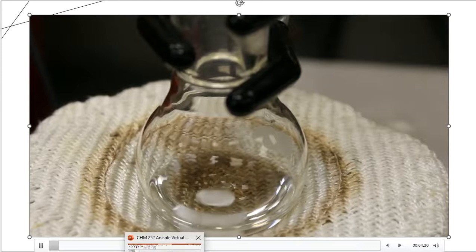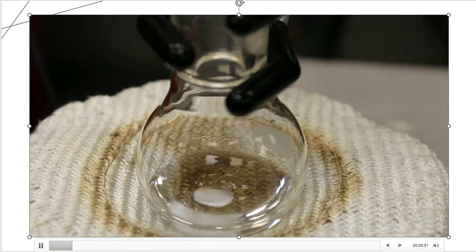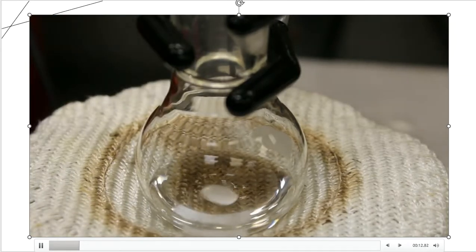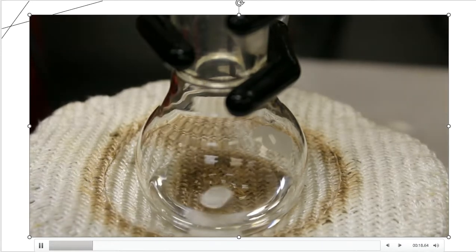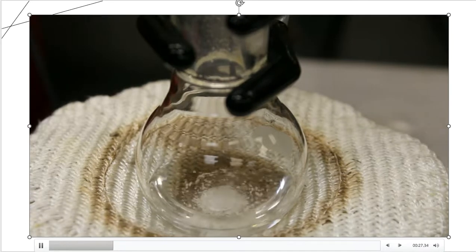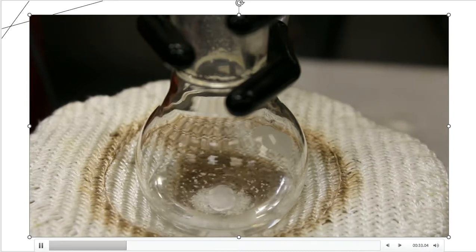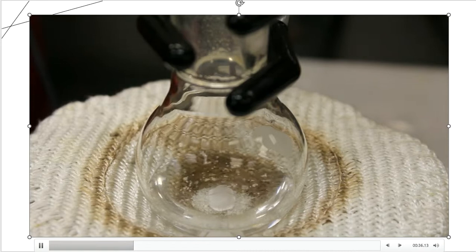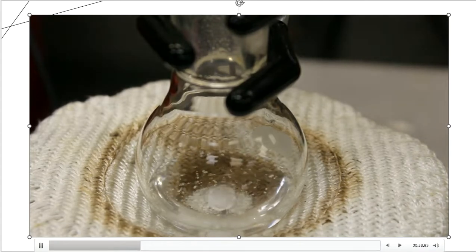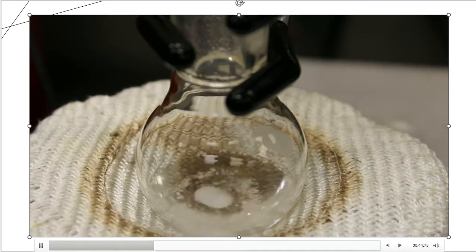All right, so the magnet is stirring in my boiling flask, and now it's time for me to add the aluminum chloride. And it says to add it in very small portions. So I'm just going to come up here to the top, and I'm going to slowly add little bits at a time. Not all at once. I don't want it to overheat or begin to bubble on me. And you can see the addition of the aluminum chloride now, right? So that disturbance is going to mess up the magnet a little bit. Not a big deal. It will eventually catch back up once this aluminum chloride begins to dissolve.